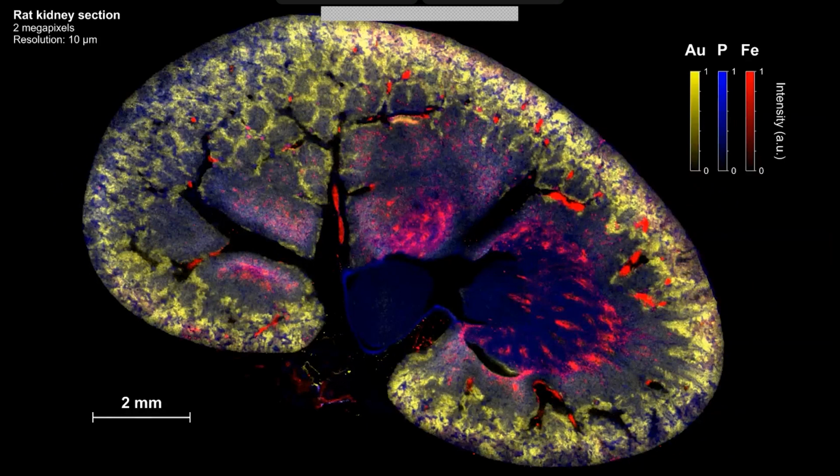So here you have a rat kidney in this case. The animal received an intravenous administration of gold nanoparticles 1 hour before being sacrificed. And then the biologists kill the rats and collect the organ. The organ was included in epoxy resin, polished, and analyzed. This case is 6 hours of measurements, a night of measurements, basically.